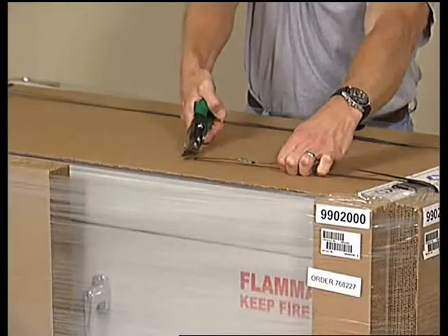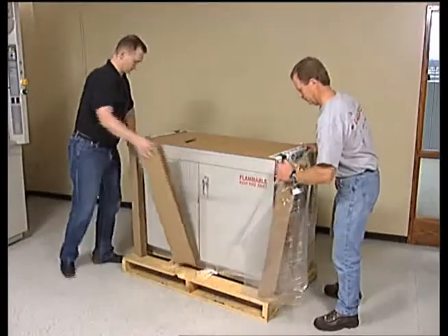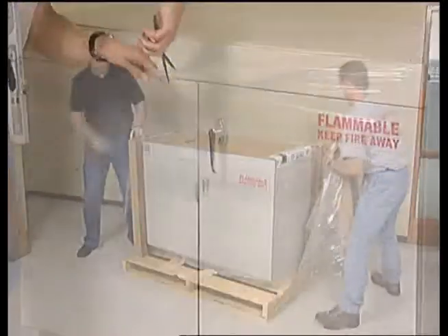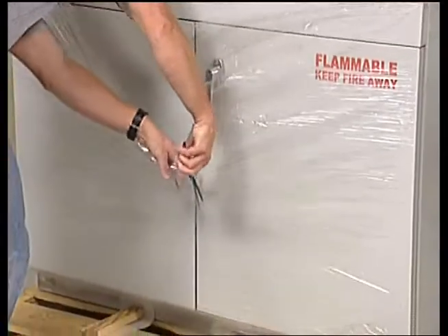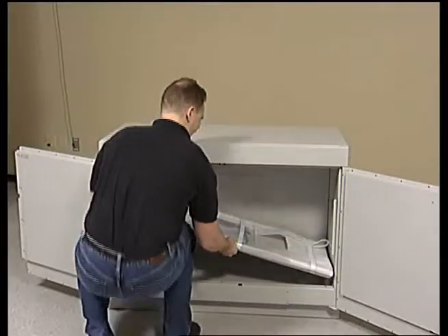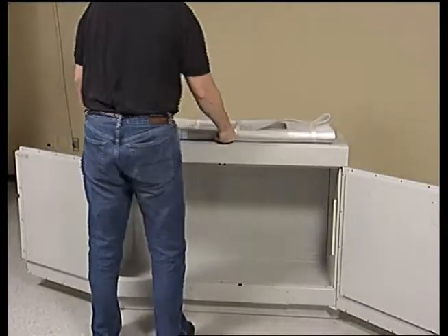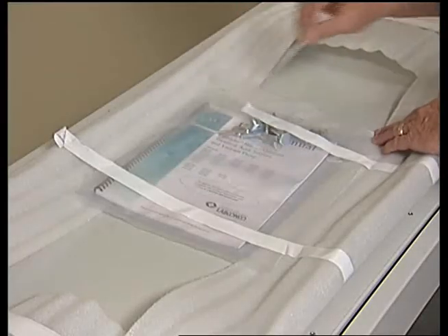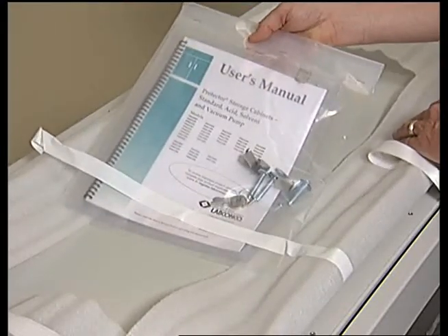Remove the banding straps from the pallet. Next, remove the outer shrink wrap and protective cardboard. Remove the product shrink wrap with scissors to avoid scratching the cabinet. Remove the filler panel hardware from the back of the cabinet and set aside. Remove the plastic envelope that contains your installation instruction manual and accessory hardware. Refer to the instruction manual during installation and set aside the accessory hardware for future use.